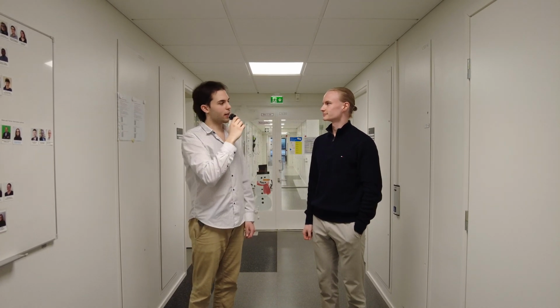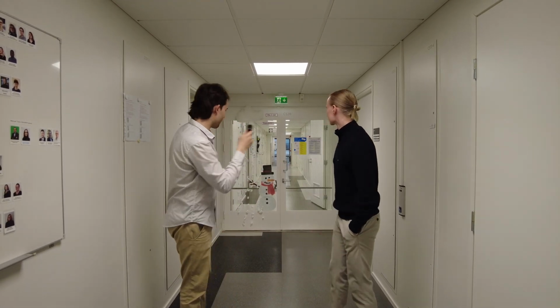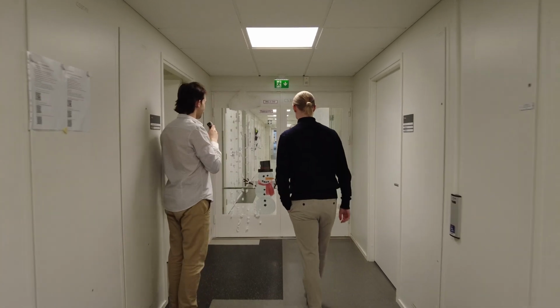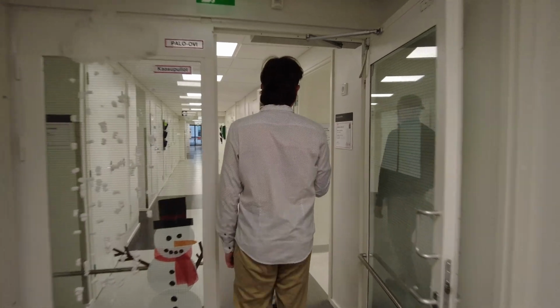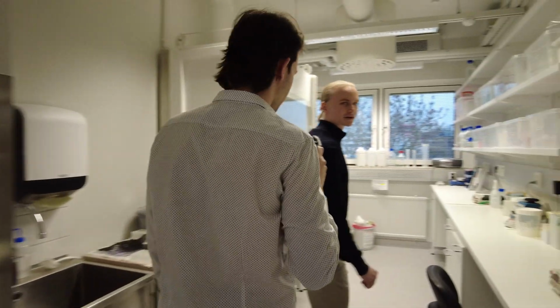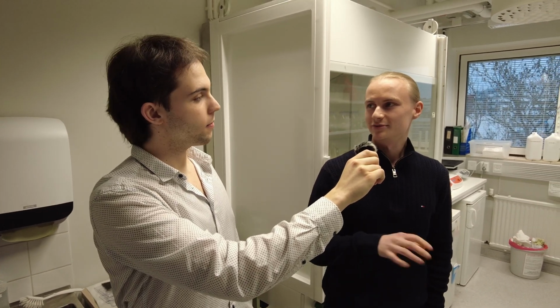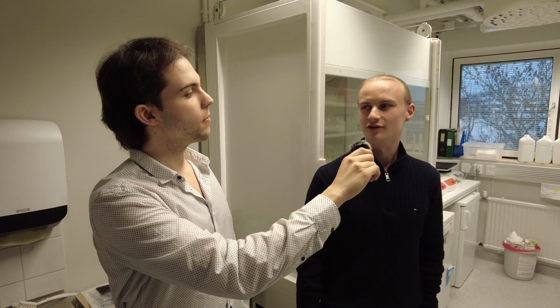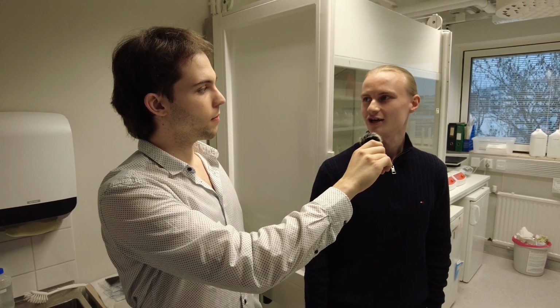Cool. And would you mind giving us a small lab tour here, so we can discuss more things? Sure thing. So here is one of our labs, which is dedicated for Western blotting. Each of our labs is somehow specified to some specific technique, but usually you can work wherever you want, but this is the normal setup that we have in most of our labs.